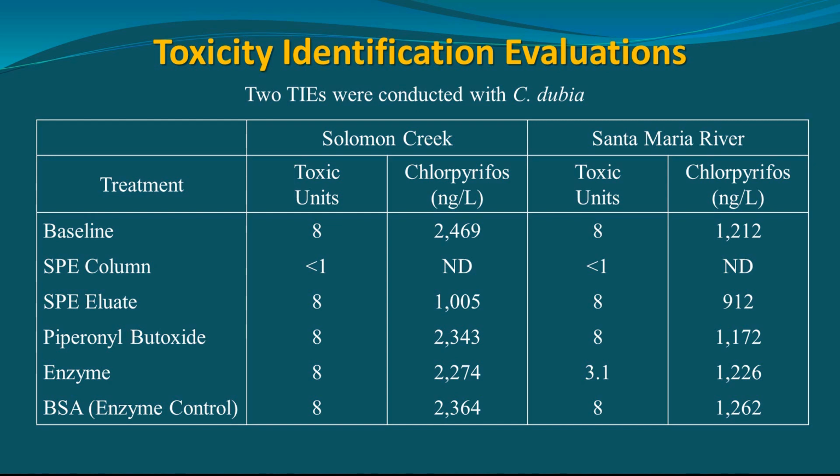Because we did a dilution series that was like 100, 50, 25, 0, again an abbreviated 3-concentration series. Instead of 5 concentrations, we had 3 concentrations and a control. And then we just did the math on that, and I think it came out to 8, because that's how the LC50 from those stats was created.